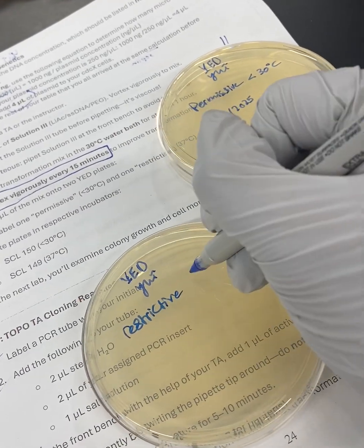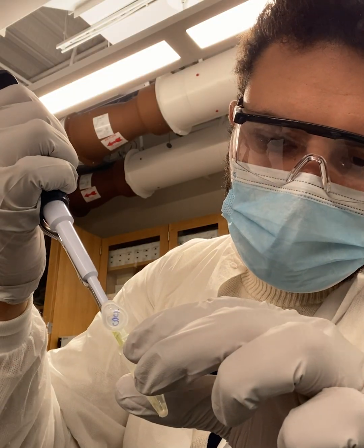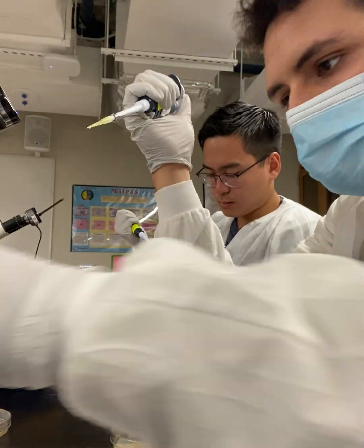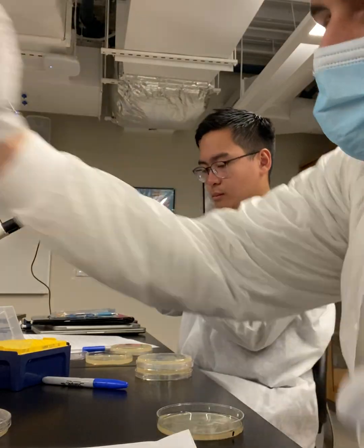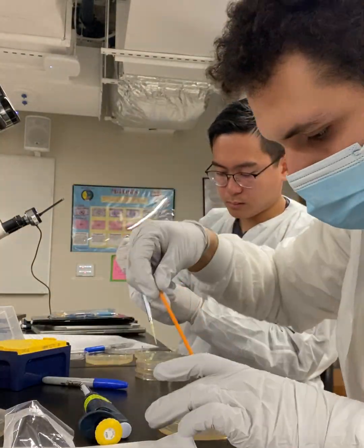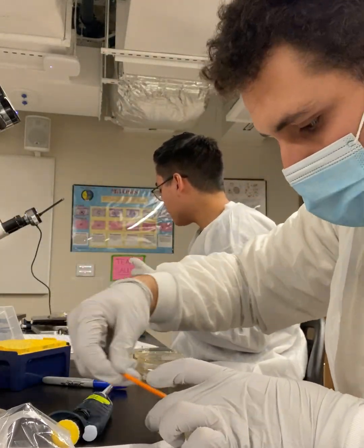After the 1 hour incubation, we plate 100 microliters of our transformation onto two YED plates, that is, yeast extract dextrose plates, which were then incubated at permissive and restrictive temperatures. If the plasmid rescues CDCX, colonies should grow normally at 37 degrees Celsius. If not, the cells would fail to septate, and thus would not be able to grow, and we wouldn't be able to see colonies form on the YED agar.